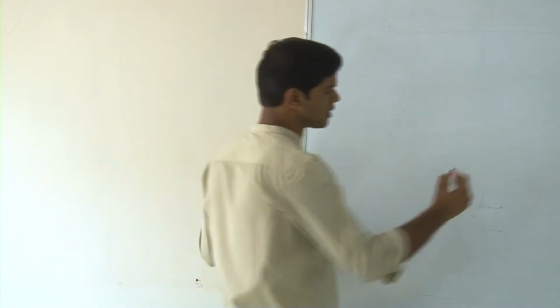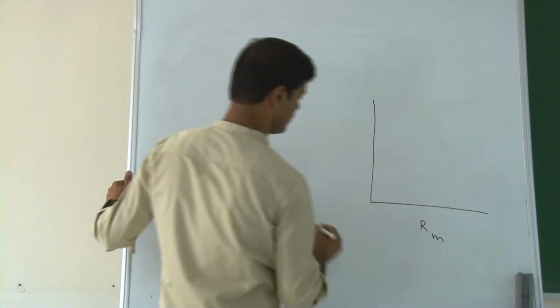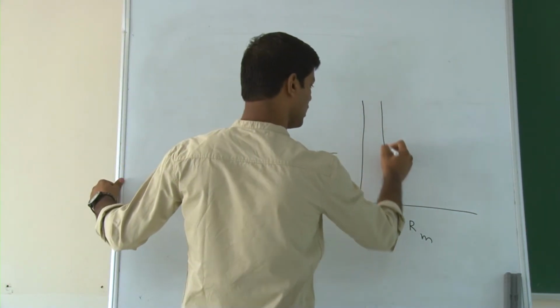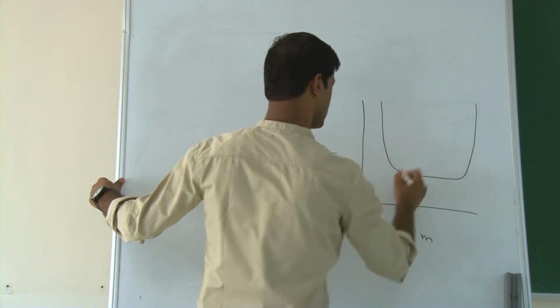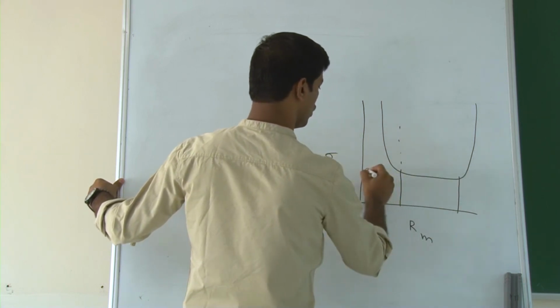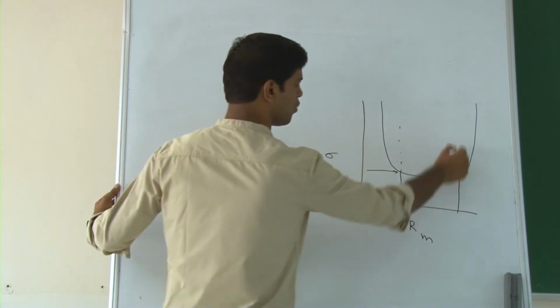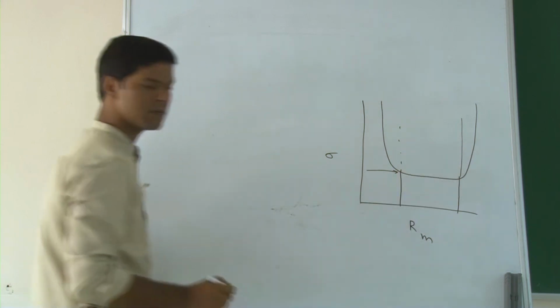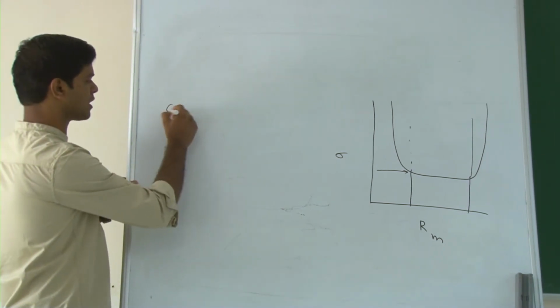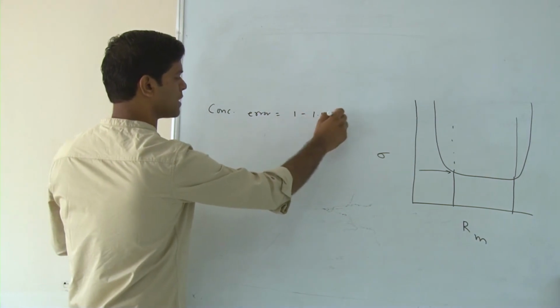What do I mean by under spike or over spike? So, when you are measuring the ratio in the mixture, and if you try to see the error associated with that, if you see the trend, it goes like this. There is only a certain zone where it can give you low error, but if it is under spiked or over spiked compared to this zone, then it may be very difficult to find a very precise number. Typically, in isotope dilution, the concentration errors are about 1 to 1.5%, and you want to achieve that.